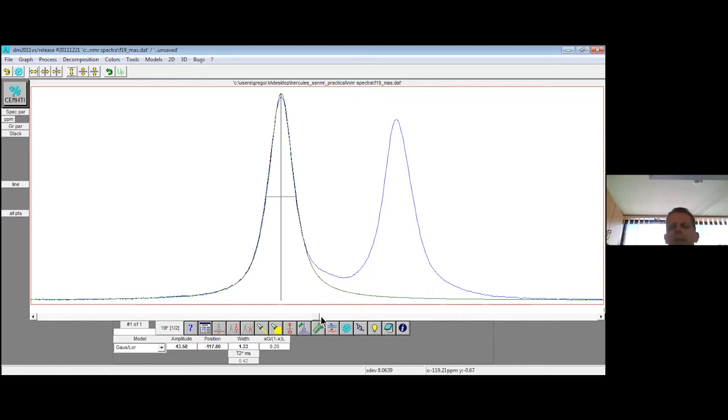I mean, it's not necessary to be that precise when building a model. I'm just showing you that lines can be different from pure Lorentzian, and very often in NMR, actually they are. Most of the cases which I've studied were closer to Gaussian than to Lorentzian, but these particular two cases have quite clear Lorentzian contributions. Okay, let's add the second line. Here it comes.